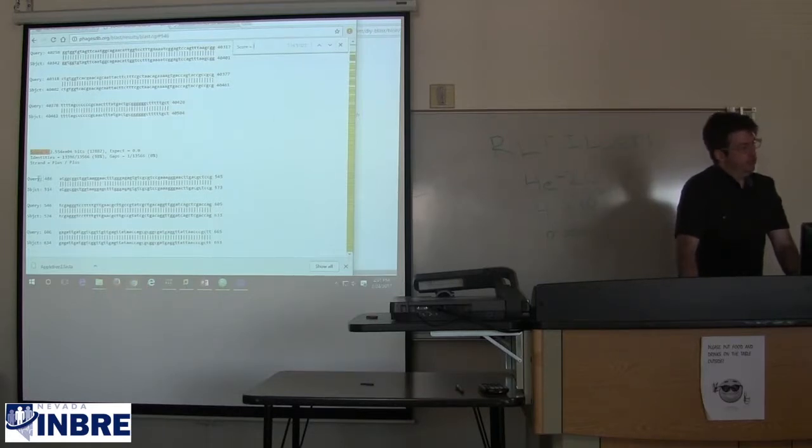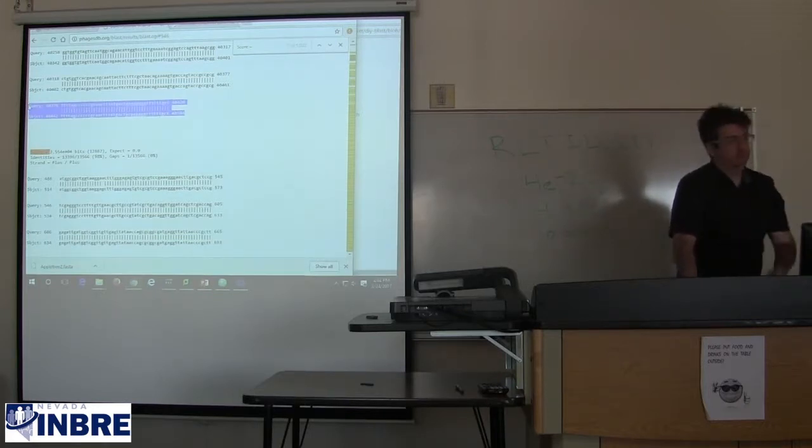And you can also note that the sequence regions are pretty similar to each other, that we're 486 on the start of this on our query, 514 on LeBron. So they're both at the beginning of their genomes, moving on to 13,000 letters later. The ones above, the longer match, was between 15,000 and 40,000 in both cases. And that's an additional arrangement similarity, that their genomes are organized in a similar fashion.